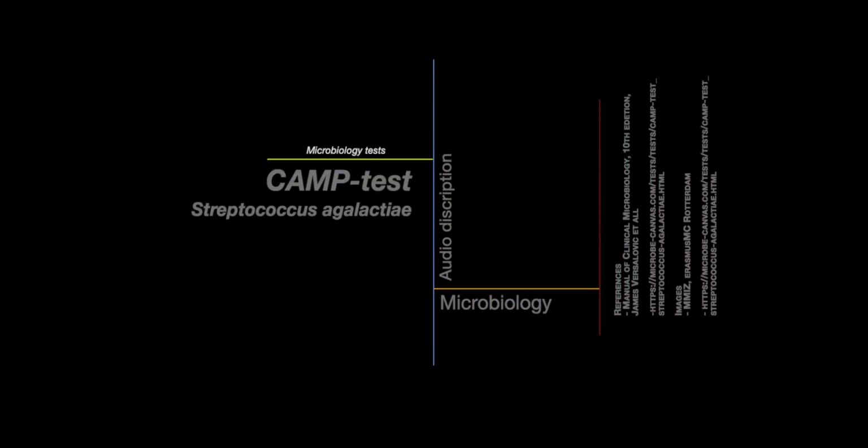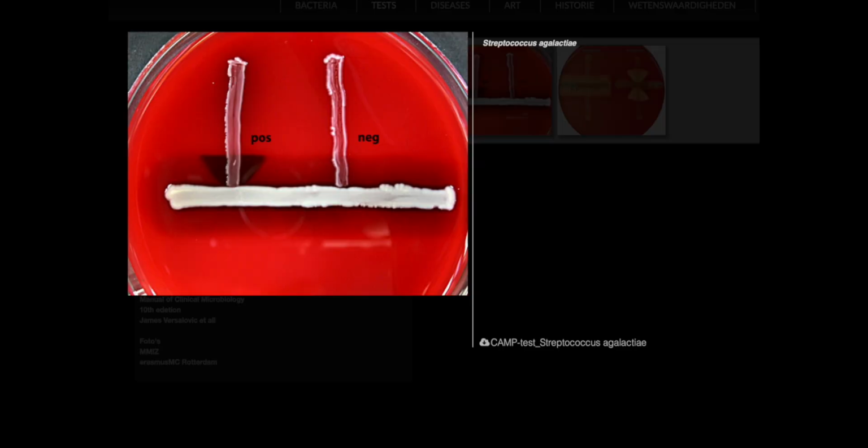Learn about the CAMP test for Streptococcus agalactiae in this informative video. We'll cover what the CAMP test is, how it's performed, and the history behind this important diagnostic tool.